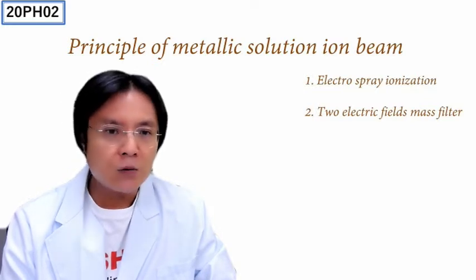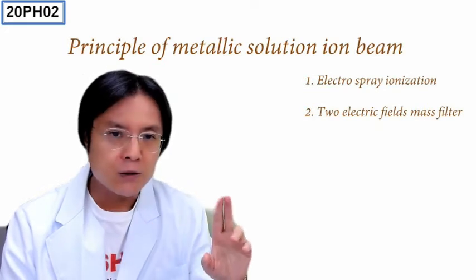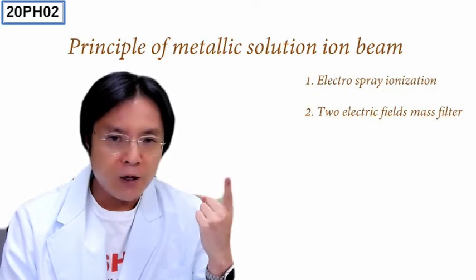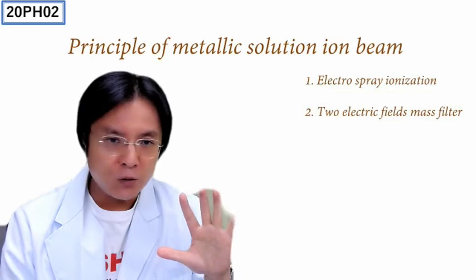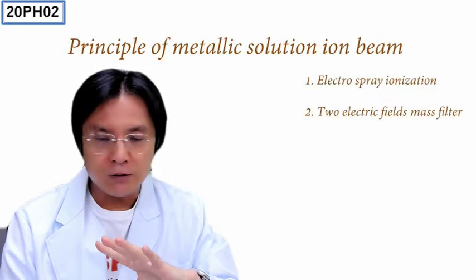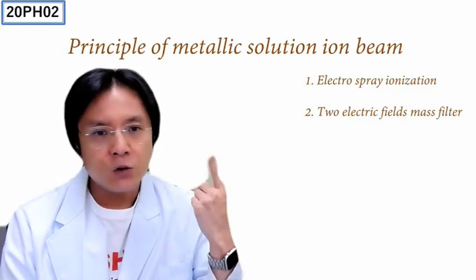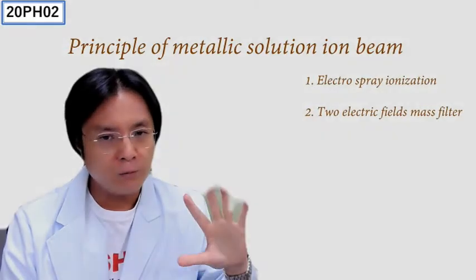The ESI technique can be applied to all liquid materials, also in a vacuum environment. In this work, we introduce the metallic solution into vacuum for the ESI method and filter it by its own weight using a newly developed two rotating field mass filter.